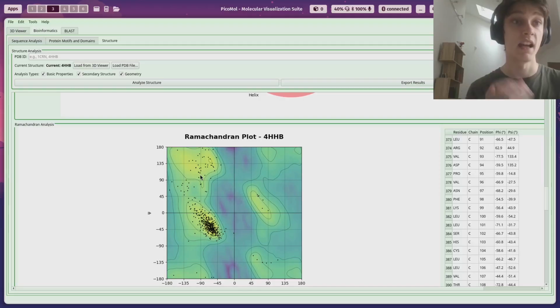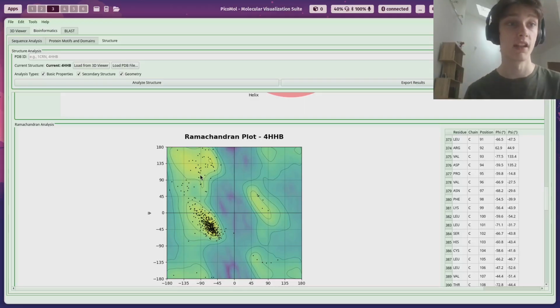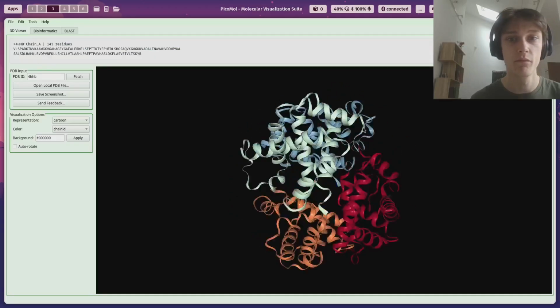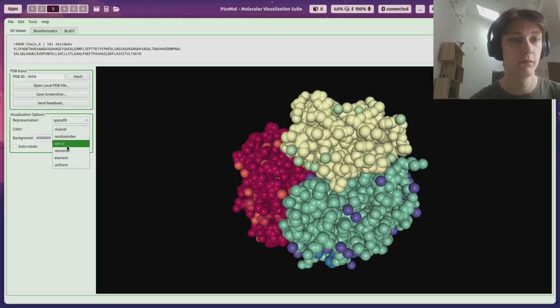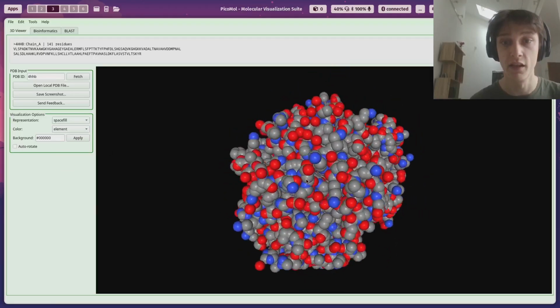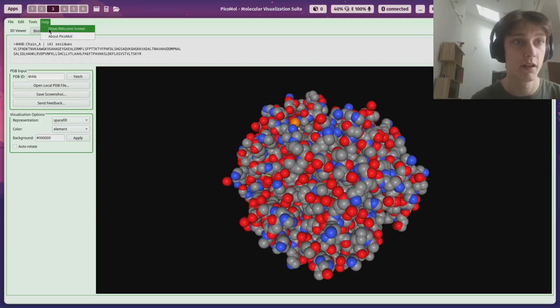Any outliers, and I want that to be accurate, I might do a more MolProbity integration actually. And surface analysis, cavity working, binding dynamic predictions, and binding site predictions as well. As well as this, I'm going to make the viewer a lot more comprehensive, although I am quite pleased at the moment it works what I want it to do.